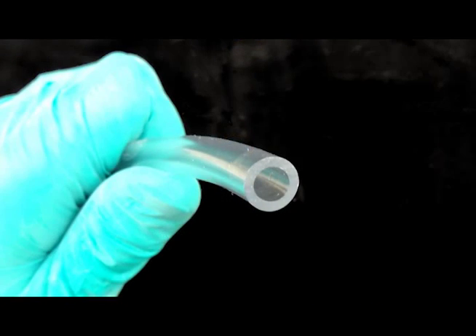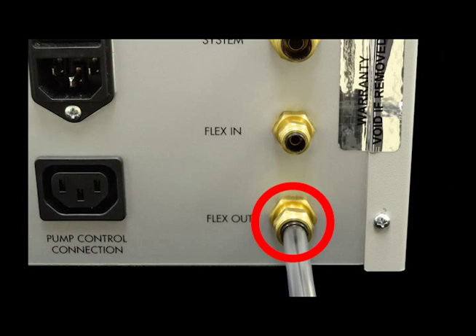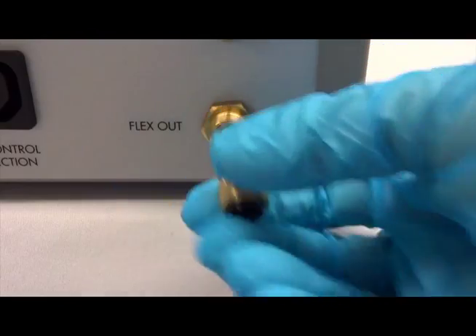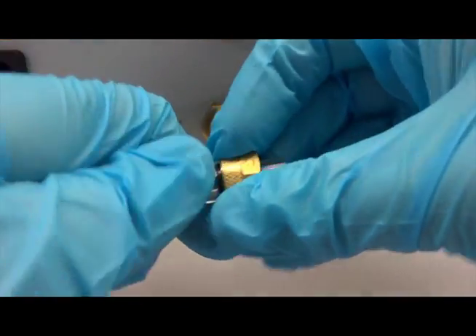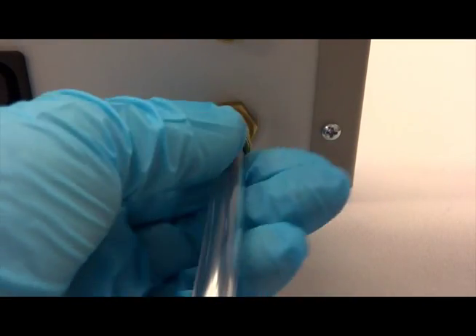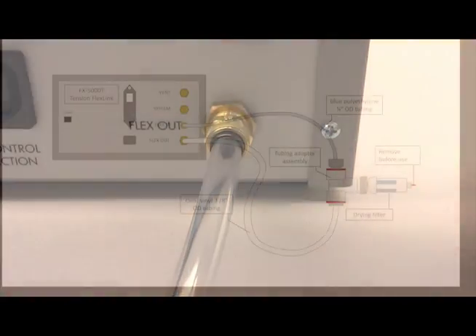Connect the clear 3/8 inch tubing from the drying filter to the FlexOut port on the back of the FlexLink. Remove the brass nut with the acetyl sleeve from the FlexOut port. Insert the tubing into the acetyl sleeve, push the tubing onto the fitting on the back of the FlexLink box, and thread the nut onto the fitting by hand.